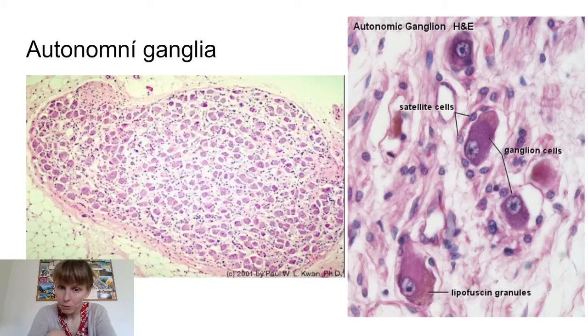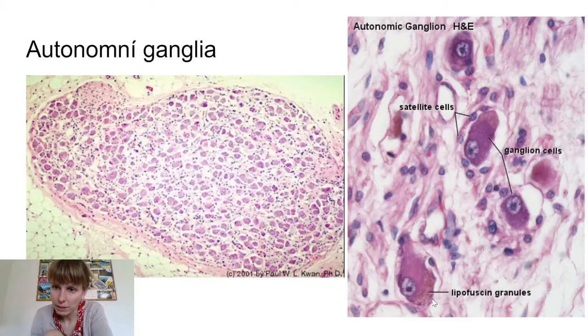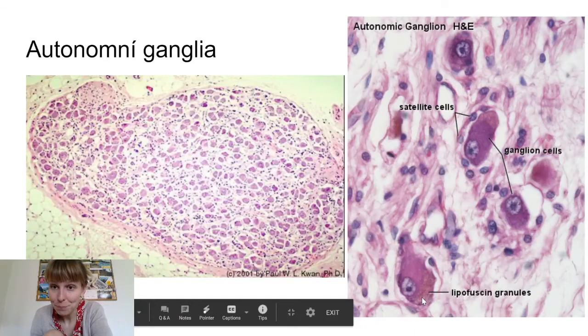So it's often found in neurons, which usually live for your whole life, and they metabolize a lot, they degrade a lot, and the residues that come from lysosomal degradation, the cells are not able to use them anymore, they are not able to get rid of them, so they just store it. So this is what lipofuscin is, and it's not functional at all, it's just residue accumulated in the cells.